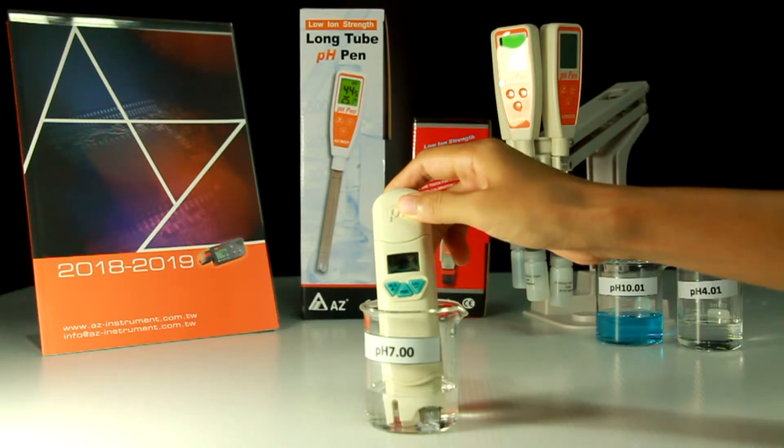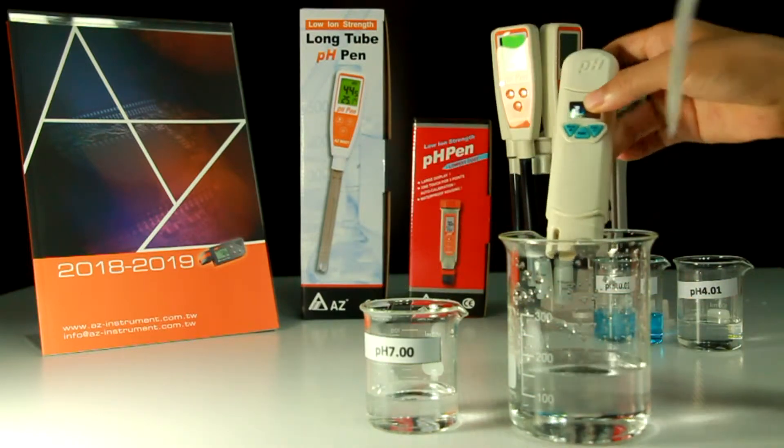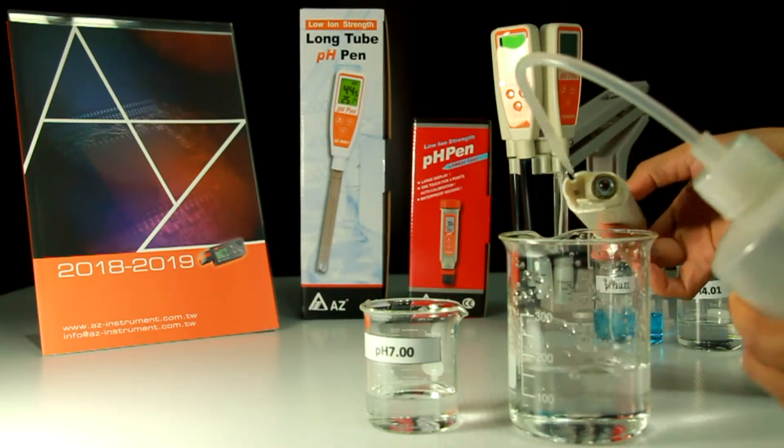Stir gently until the reading is stable. You will see the save icon and end icon appear on the display. Clean the electrode with water and blot it — do not wipe it.